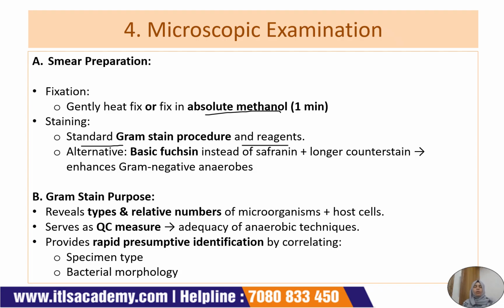Now, what is the alternative to these reagents? Basic fuchsin instead of safranin, with a longer counterstain time, can be used to enhance gram-negative anaerobes. What is the purpose of the gram stain? The gram stain reveals the types and relative numbers of microorganisms along with host cells.